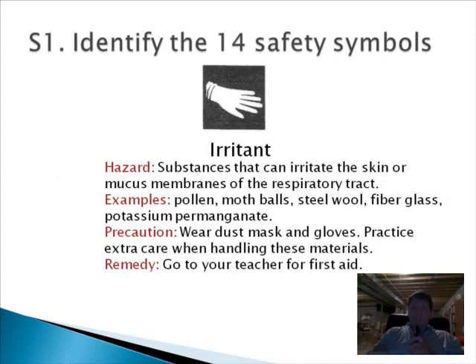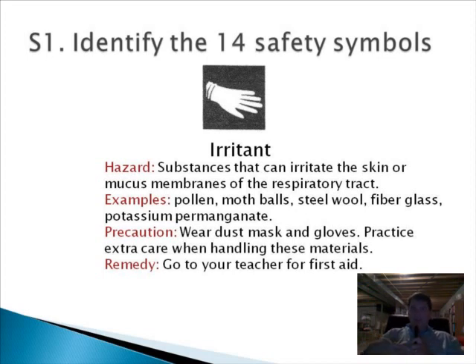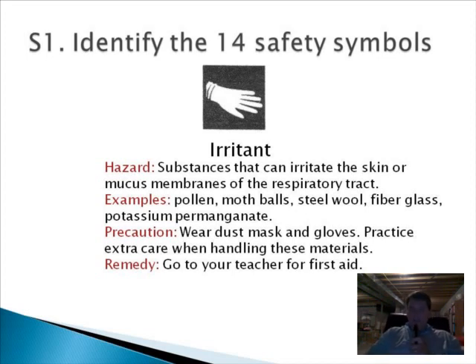The next one is the irritant symbol, shown as a gloved hand. This applies when we deal with chemicals that can be irritating to the skin or cause discomfort. It's not necessarily a dangerous chemical — you're not going to be seriously hurt, but it's more of an inconvenience. Things like pollen, mothball, steel wool, fiberglass, and potassium permanganate will irritate the skin, making it red and itchy. When working with this kind of stuff, consider wearing a dust mask and gloves. If something gets on you, wash your hands and rinse with plenty of water.